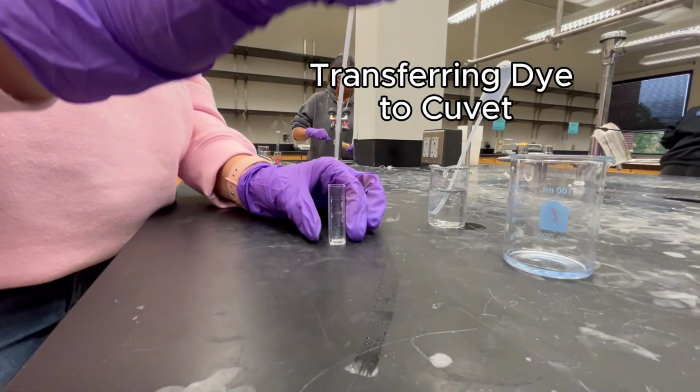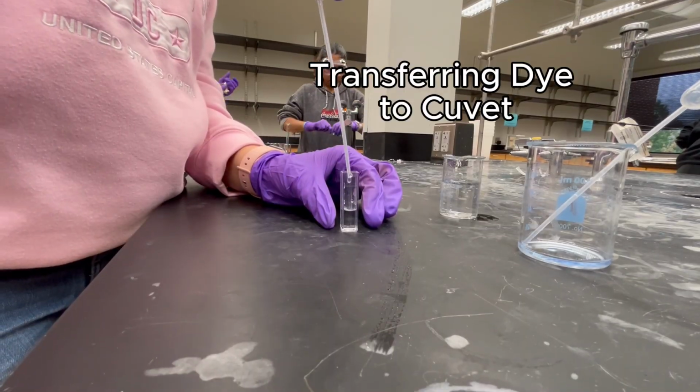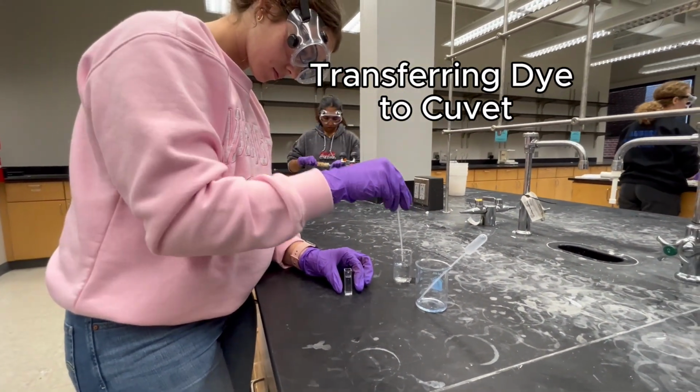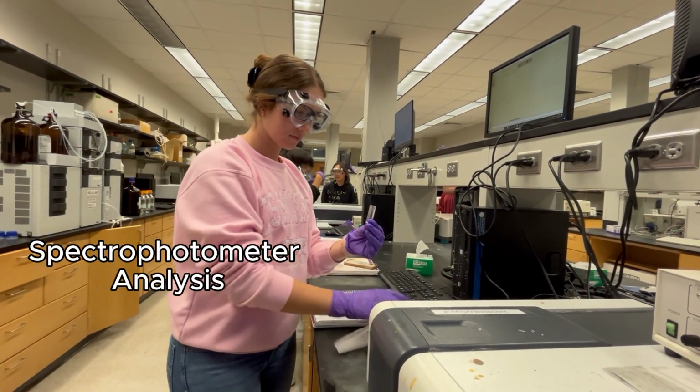First, we have to transfer our dye to our cuvette, so we drop 2 drops of our dye into the cuvette and then dilute it with water until it reaches the fill line, making sure it doesn't overfill past the meniscus. Now we do our spectrophotometer analysis.